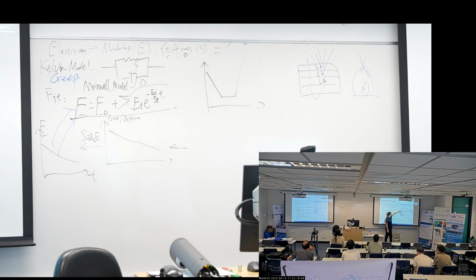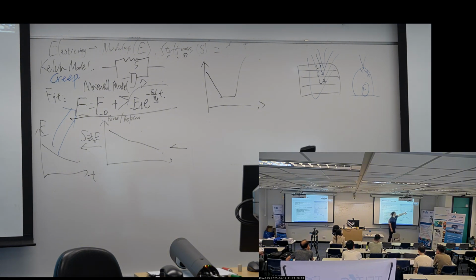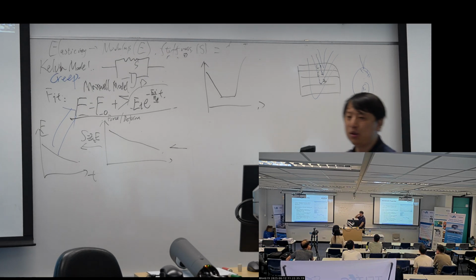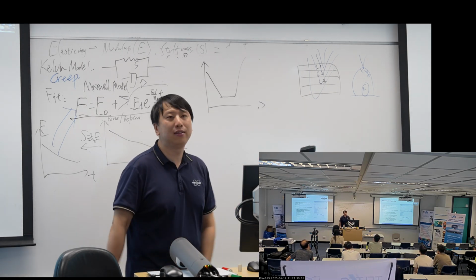When moving down, we reach a certain force, and we hold our Z, or we do a relaxation here, and then we keep going down, hold, and then we go up, hold, and lift. So you can define your own force curves.